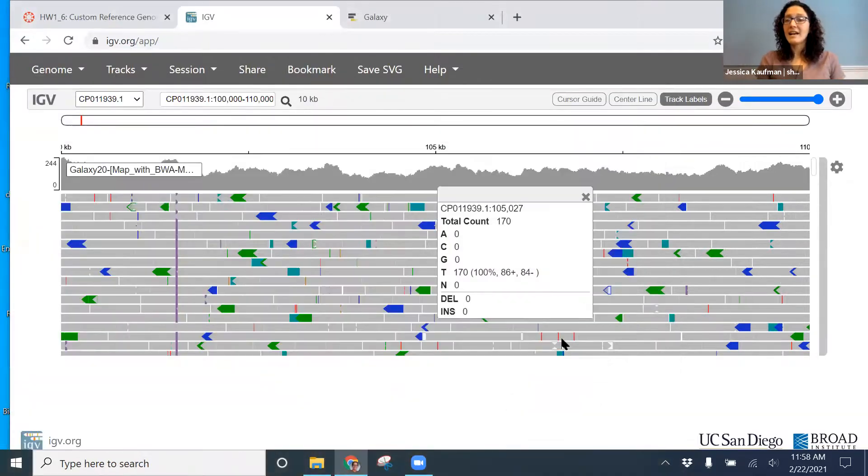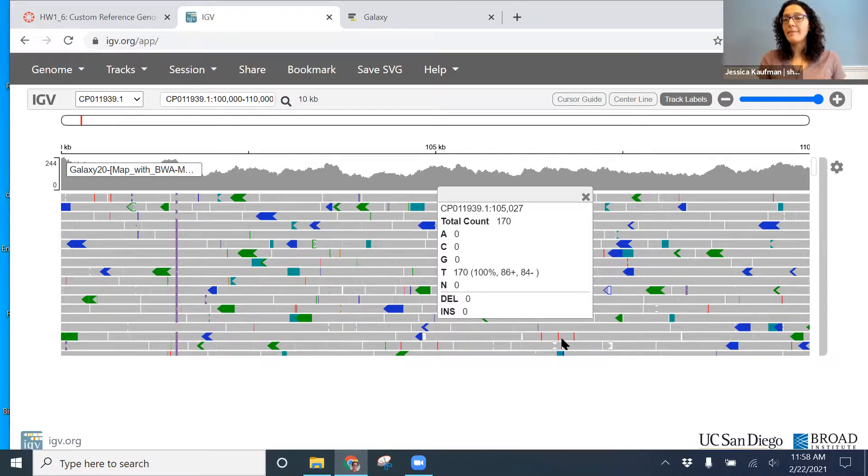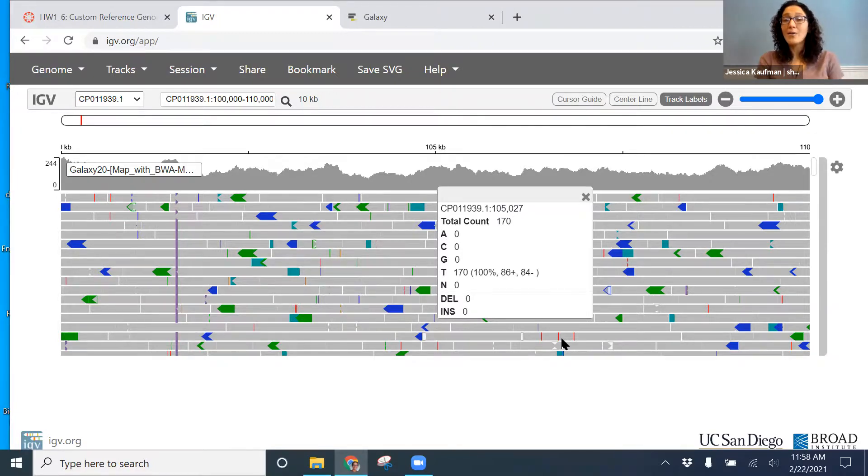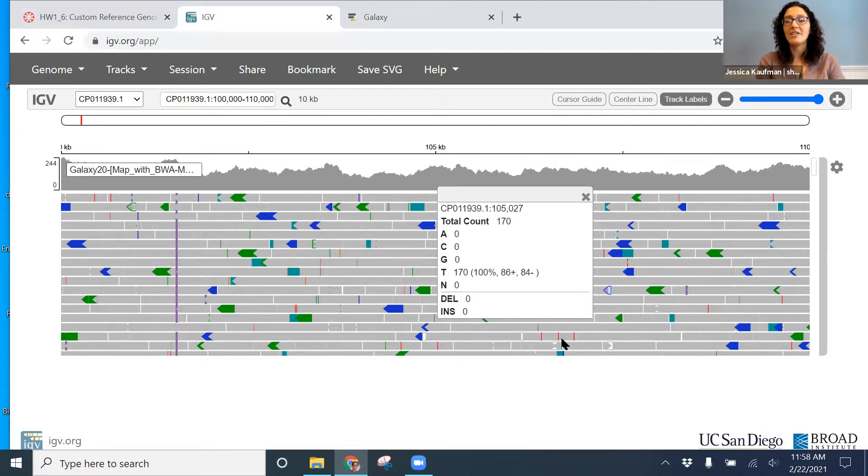That's how you're going to make your figure showing your IGV results and what your alignment looks like for your assigned region. Let me know if you have any questions on taking Galaxy BAM files and viewing them in the IGV web app.